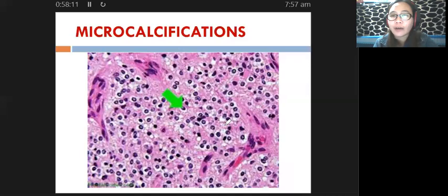And apart from that, the processing of your tissue sample did not interfere with other steps. Kaya nga hindi mo siya na-detect. You were not able to detect it during sectioning. And so, remember what is usually affected if decalcification is not performed. It's your staining, sectioning. Okay, it's your sectioning. But since you were able to produce naman good sections from your sample, then it's fine. So the presence of microcalcifications, as long as it does not interfere with sectioning, it's fine.